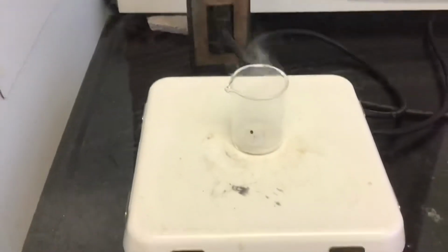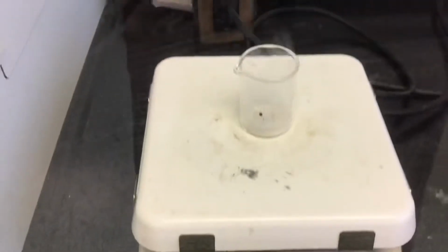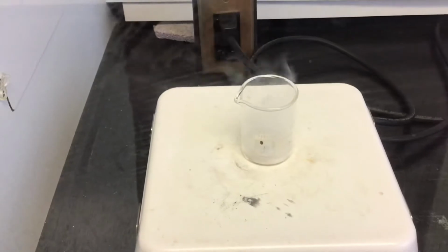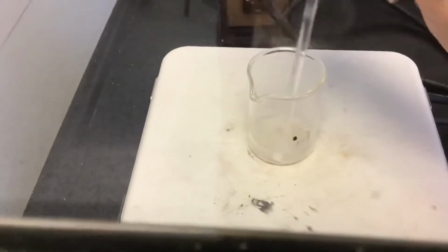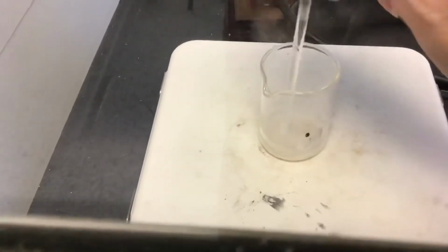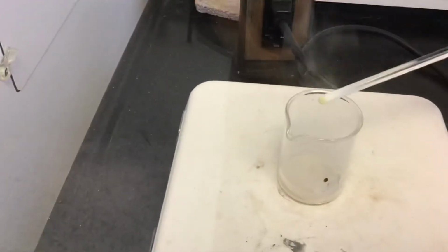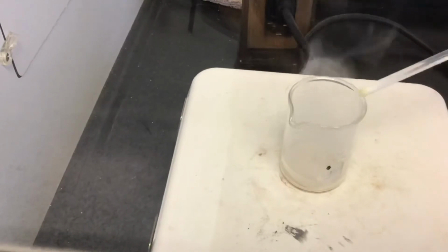This is what happens when your hot plate is hot, and you're heating your mixture, and you can see that white smoke coming out of there. That white smoke is the ammonium chloride. I'm just going to lift up the hood slightly, and I'm going to stir it, because I want you to stir it to help get rid of all of it. There is some on the end of my stir rod right here. I'm going to pull it out of the hood now.